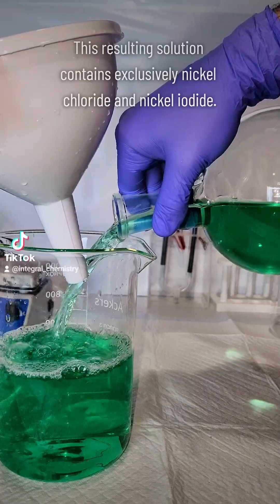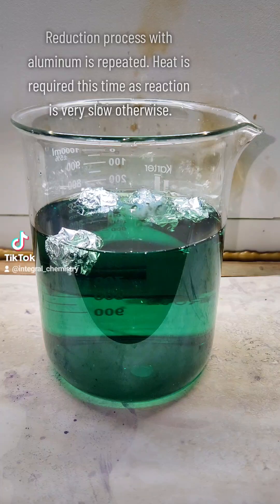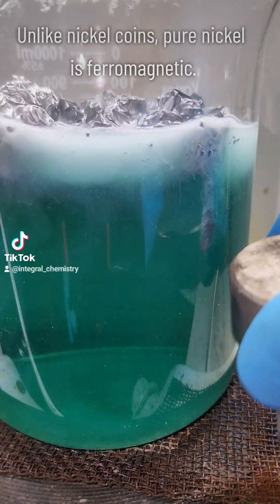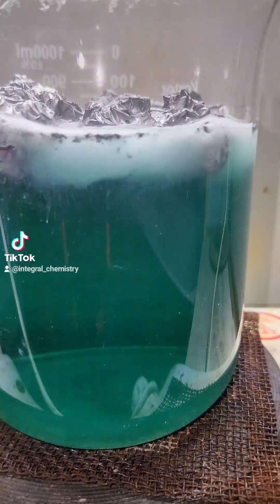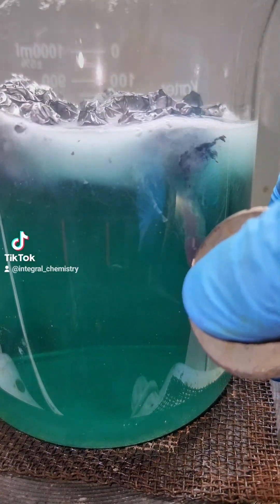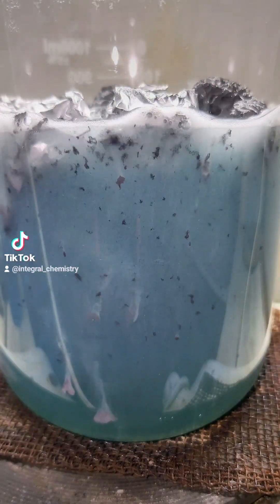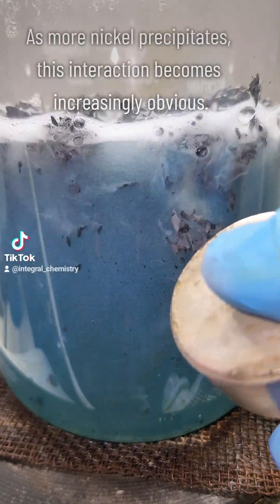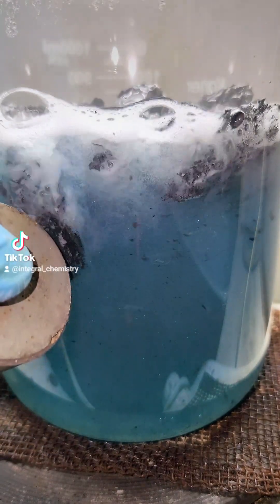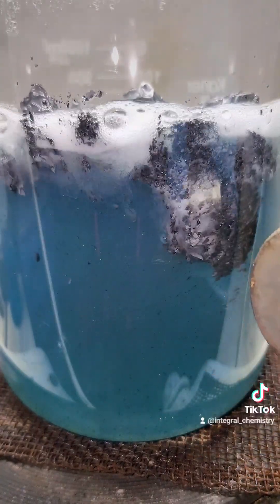At this point there are no copper ions left — what I have is a solution of nickel chloride and nickel iodide. To separate my nickel metal out I'm going to do the exact same aluminum reduction process, but this time I'm going to apply some heat as the reaction is very slow on its own. You'll notice that the nickel particles being precipitated out of solution are attracted to a magnet, because pure nickel metal is magnetic. This magnetic attraction becomes more and more obvious the more nickel is precipitated — I just think it's pretty cool to look at.